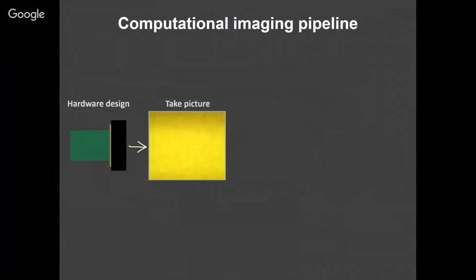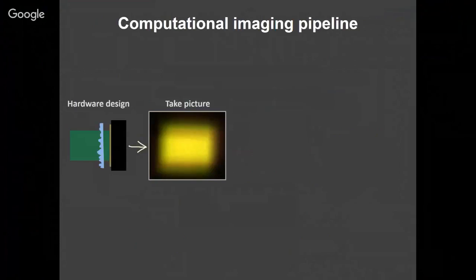So what we do is we put this diffuser in. The diffuser is really just a bumpy piece of glass. It's literally the stuff that you put on your windows for privacy, so like privacy glass sticker stuff. If I put this privacy glass sticker stuff in front of my sensor, then it just messes with the angles of the light, and then it propagates a small distance.